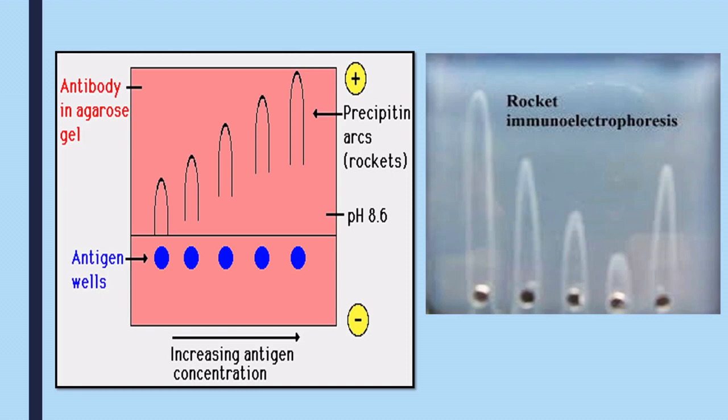Now, if you remember, in biochemistry practicals so far, many times you have quantitatively estimated the presence of proteins in an unknown sample, say using the Folin-Lowry or biuret method, or you have quantitatively estimated the concentration of DNA using the DPA method or RNA using the orcinol method, so on and so forth. There are many, even glucose or dextrose in the DNSA method. So there are many methods in which you have estimated the concentration in an unknown sample using a standard graph, and that is what we are going to use in this method.